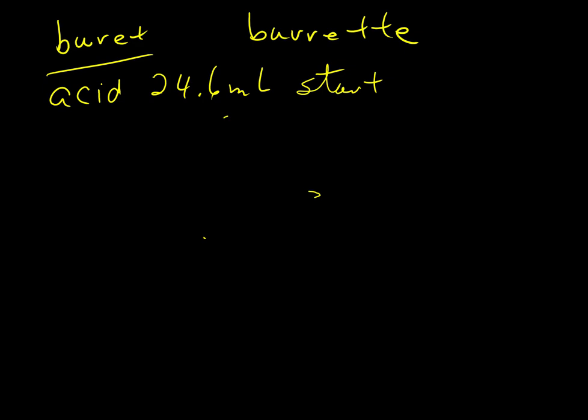Okay, fill up the tip. A little tricky sometimes, it gets a little air bubble in there. And this is starting at 7.4 milliliters, because remember, 0's at the top. So the base was 7.4 milliliters. Then I take a flask, and I didn't bring enough flasks out.